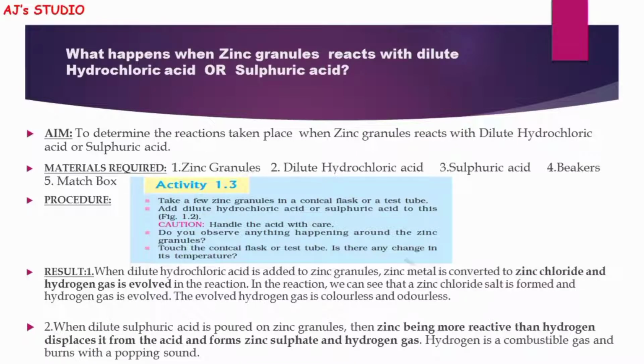Dear children, did you all hear some sound? Good. That sound we call a popping sound. We could hear this because of the formation of hydrogen. Dear children, do you all want to hear that sound again? Yes, come, let's hear it. Yes, did you all enjoy hearing the popping sound?